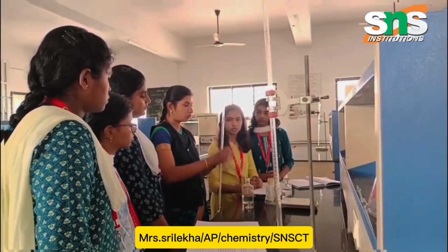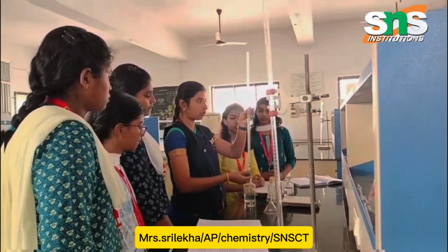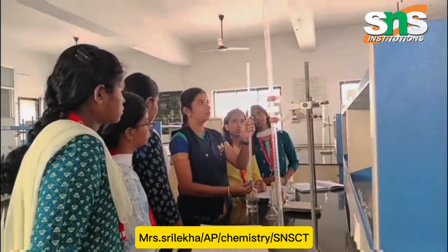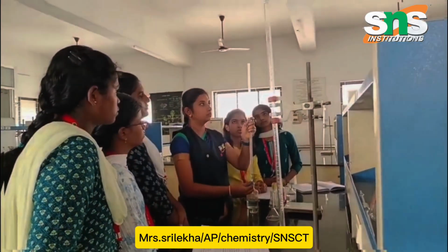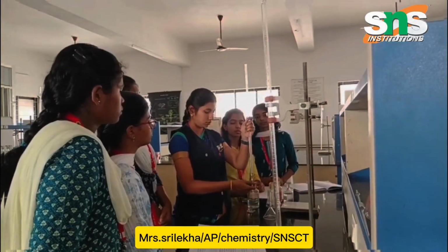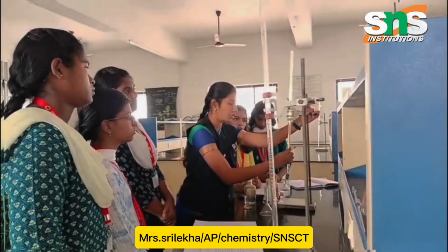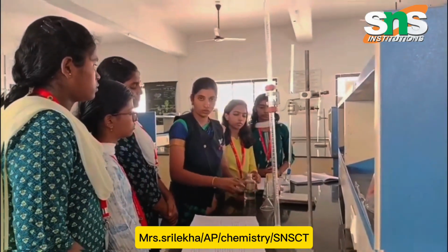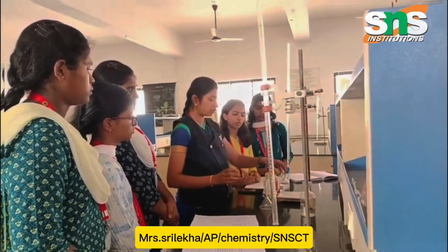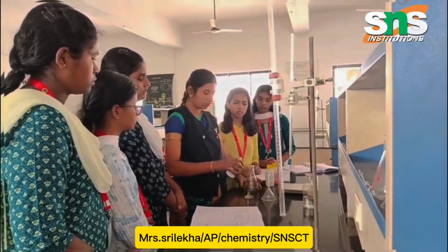We can add the solution up to 0, and we can always add the excess solution and adjust it to the 0 reading. After fixing the 0 reading, we fit the burette. Next we add 20 ml of the water sample into the conical flask.